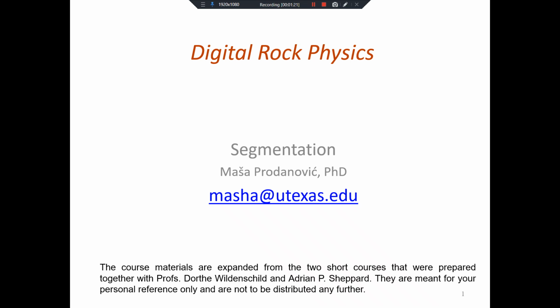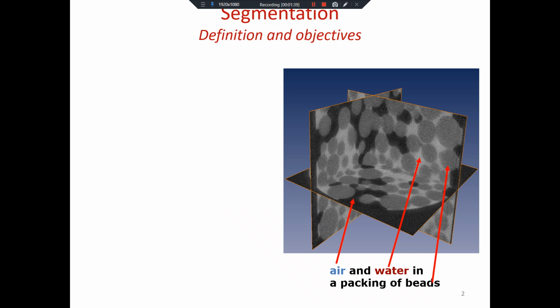And that's common in any kind of imaging, right? Your images see what they see depending on the equipment, and that's what you're seeing as a constant phase within your image if your imaging is done well. Other than that, you need a contrast agent, right? Okay, so when we have air and another fluid, typically we're good, so we can see air, which is nothing, versus almost nothing versus something that we can typically see.